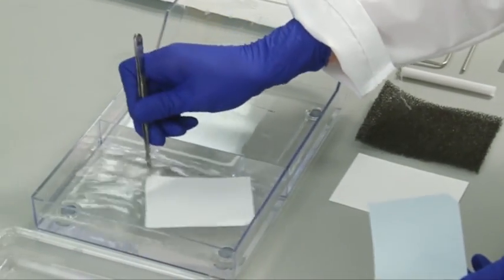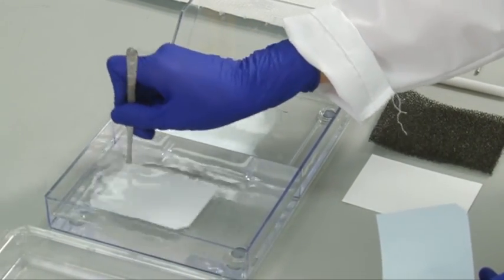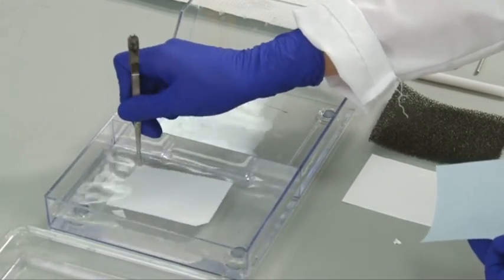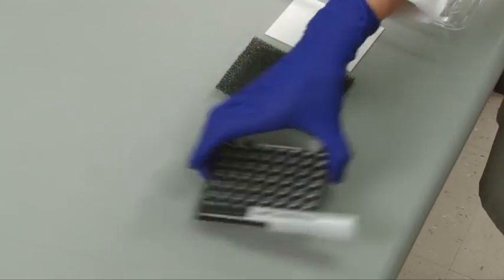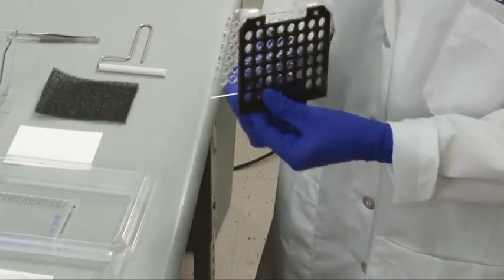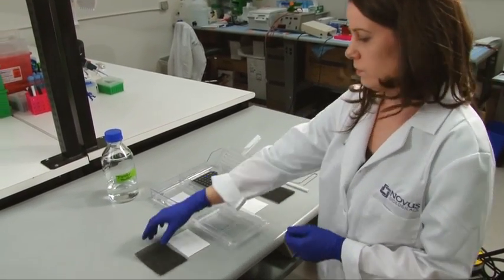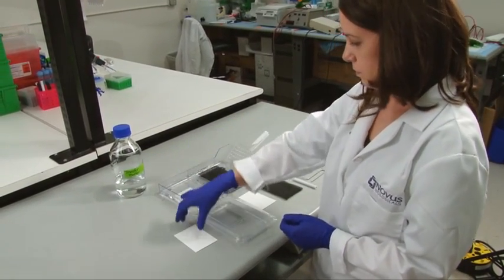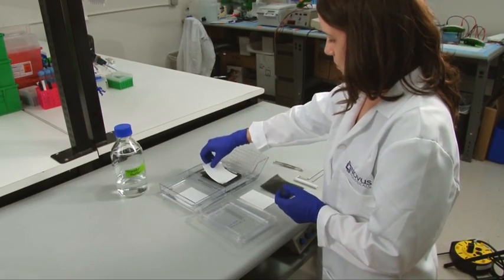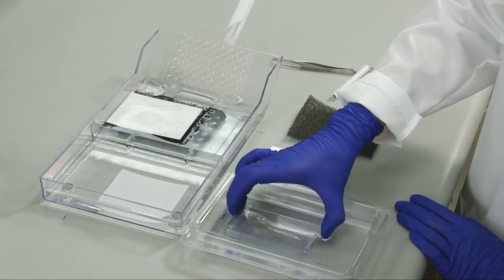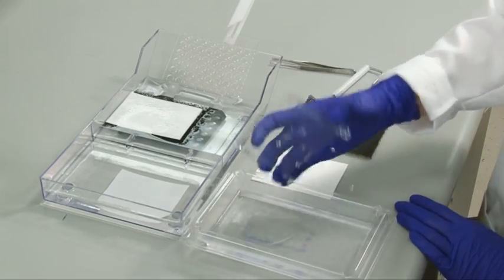Create a stack by placing the following components from the black negative cathode to the red positive anode: sponge, filter paper, gel, membrane.